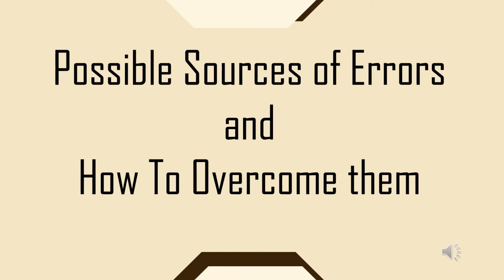In terms of standard deviation, the highest standard deviation obtained was 3.725, and that was for U2. The cause of the deviation is most likely due to the preparation of samples not being done properly, as parallax error is bound to happen. Adding on, the time at which the samples were prepared or obtained is unsure, hence they were left in the lab for a long duration. It can be said that this would affect the concentration of the sample due to the temperature dropping.